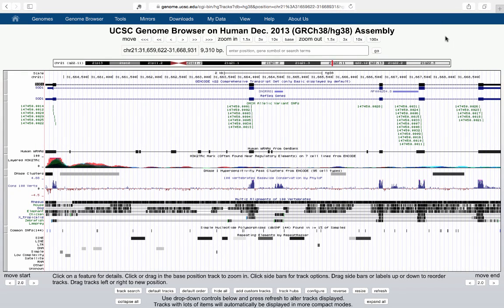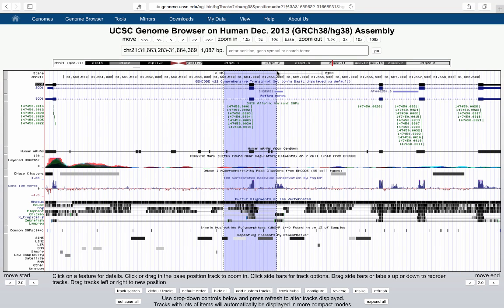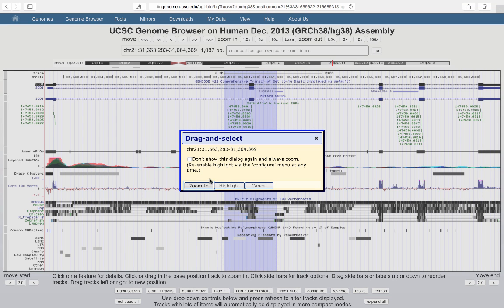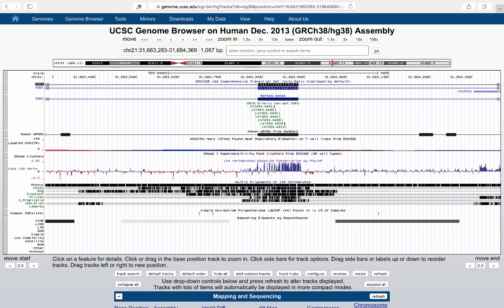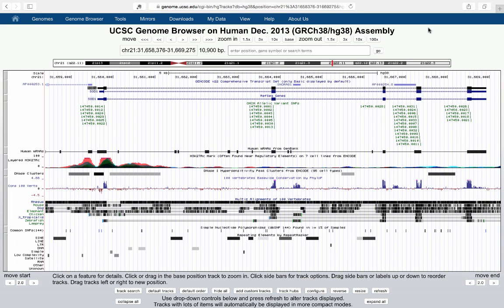There's another very useful trick with the base position track: you can use it to select a specific region. If you click on it and drag, a box opens that allows you to zoom to that region. I'll say zoom in here and it will zoom me in to that specific region. Then I'll go ahead and zoom back out. Now we're looking at the full SOD1 gene again.